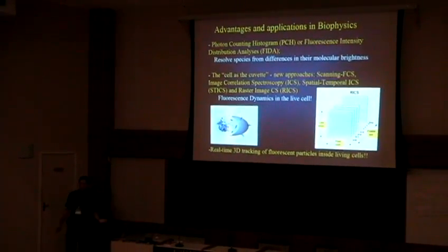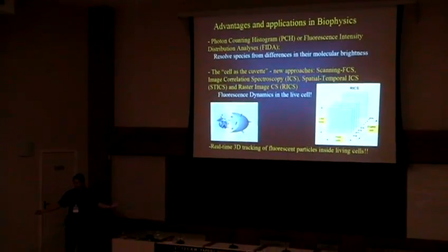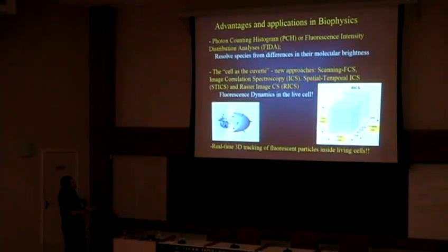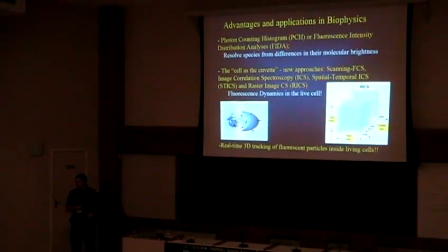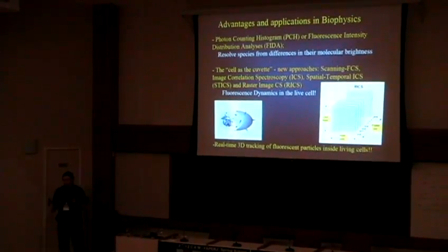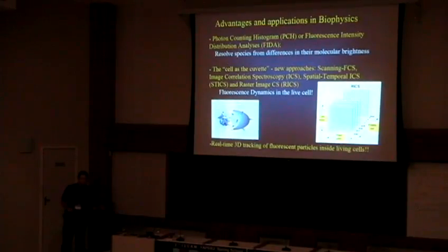To have this in a microscope, come on, we don't need those cuvettes. We have the cell, the proteins are there, of course you have to put the labeled proteins inside the cell. That's the difficult part. But once you get that, this is your cuvette now. And you have an observation volume that you can put anywhere in the cell, in any place you want. So you can observe and take data from any place of the cell.